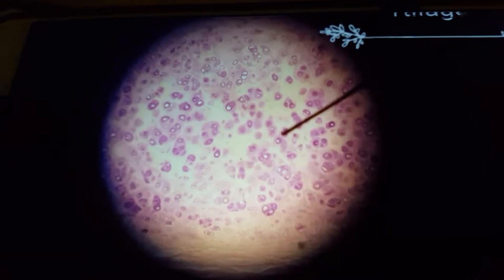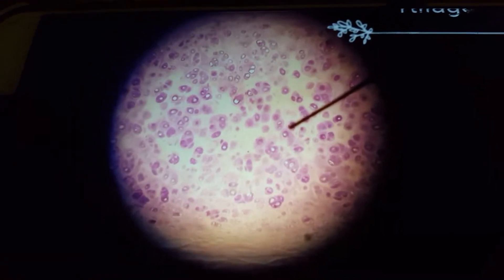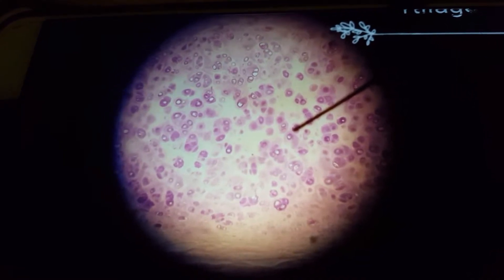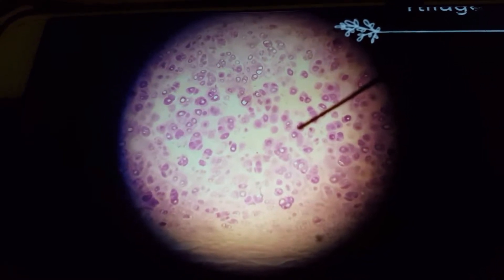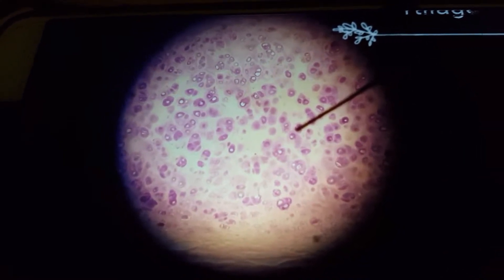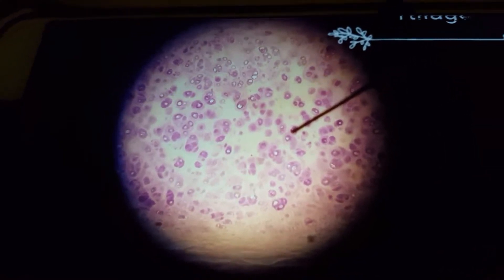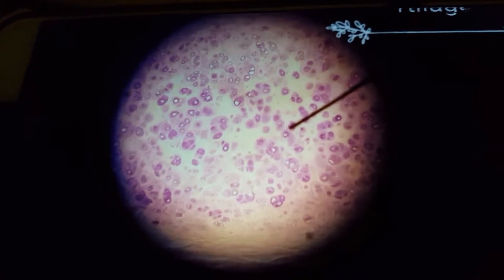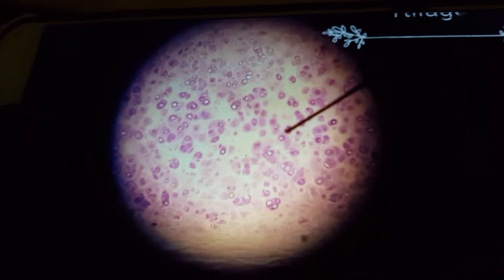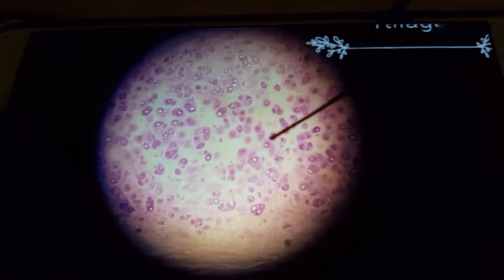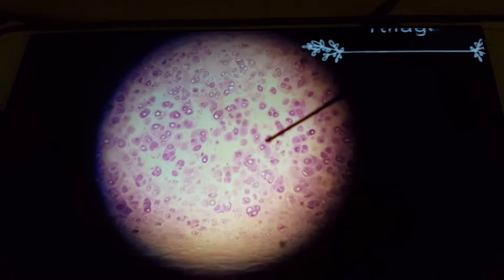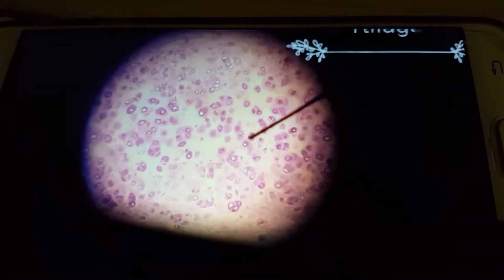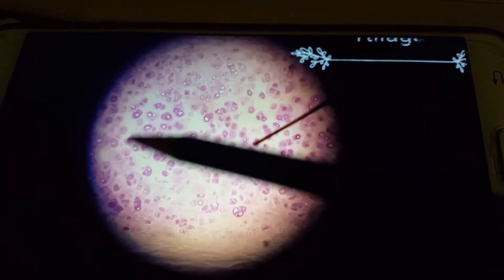Hi guys, today I'm going to do a video on hyaline cartilage. Previously in the histological slide series I did a video on fibrocartilage, so please do watch it before you start comparing both of them.